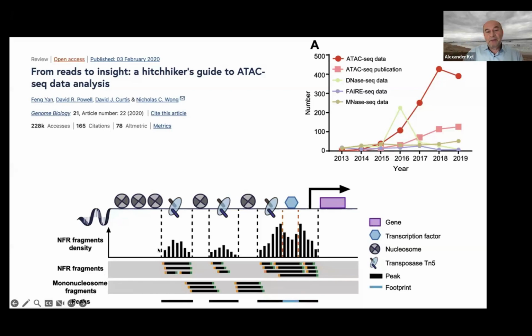And then we map those fragments back to a genome, and with that we call them peaks. We see those regions which are open. Sometimes some of the regions are occupied by other proteins, for instance by transcription factors, and that's a topic we are going to talk about today. Those areas may be protected from this enzyme cutting, and sometimes you see in the profile of the data some little valleys where you can expect transcription factors sitting. But basically, the general concept is that the whole area is more or less open for regulation.